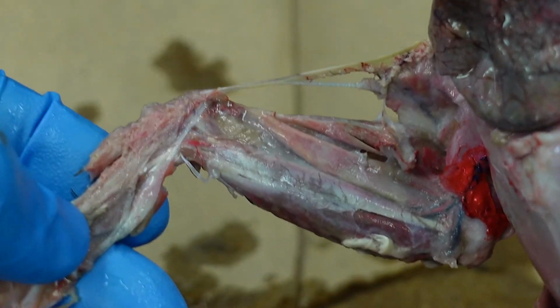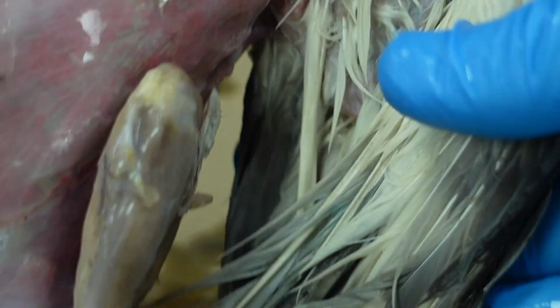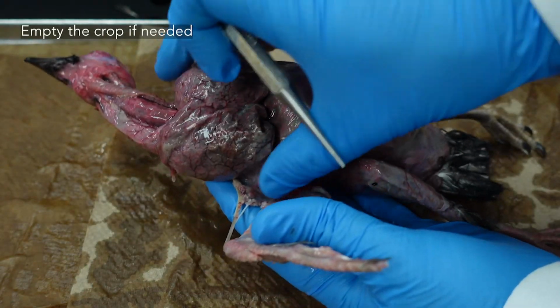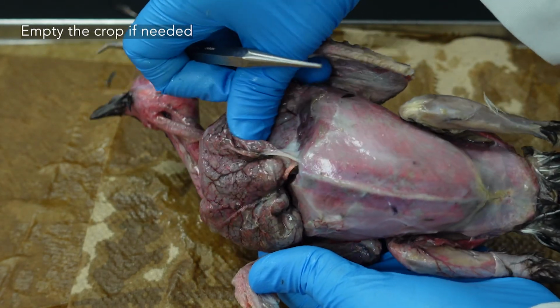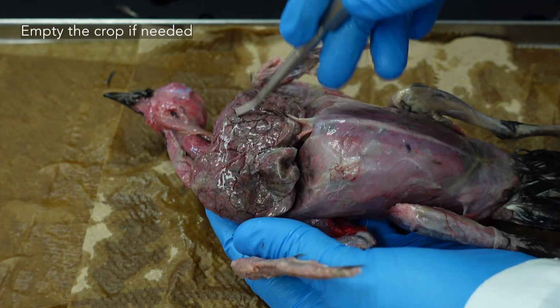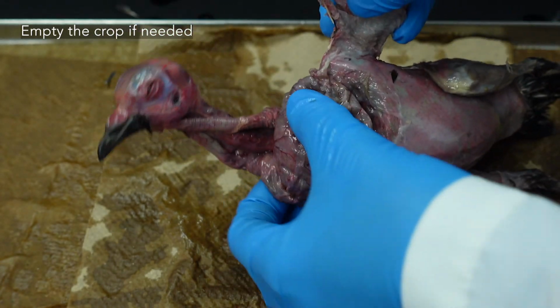So we have a nice wing here, ready for muscle dissection. Do go ahead and skin the other wing, just again so you don't have feather fluff everywhere. All right, now that you've skinned your bird, like I said, if this crop is particularly enormous, so if it is getting in your way, you can cut a little opening and empty it out. Because this is a little ridiculous.